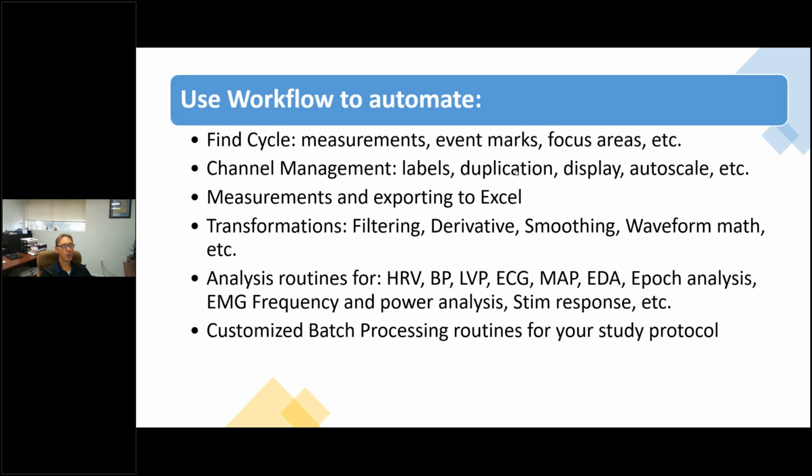You have access to all the transformations, filtering, derivative, smoothing, waveform math, etc. Any of the analysis routines that are within AcqKnowledge, so things like the heart rate variability, blood pressure, left ventricular pressure, the electrodermal that I just showed you, basically anything that is part of the existing menu structure can pretty much be used as an action item within one of the workflows.